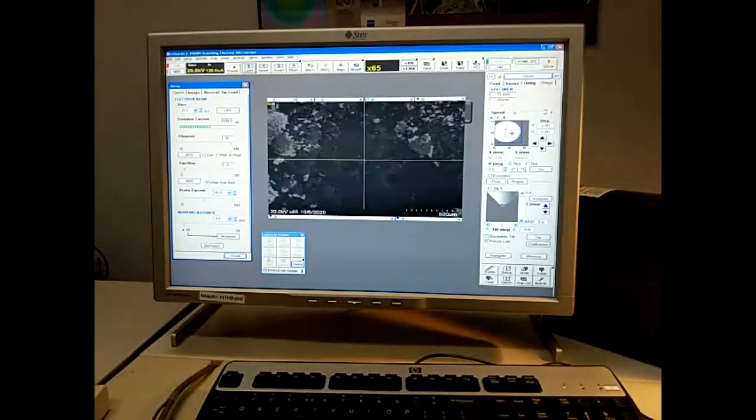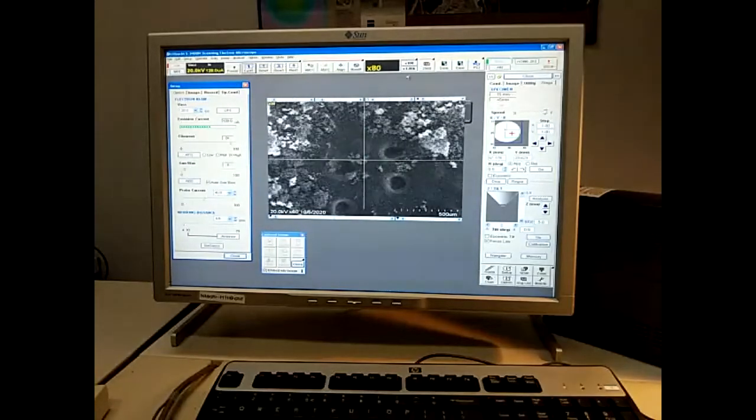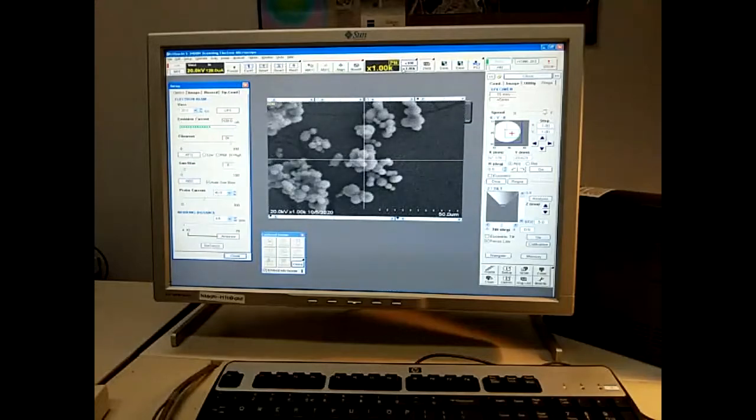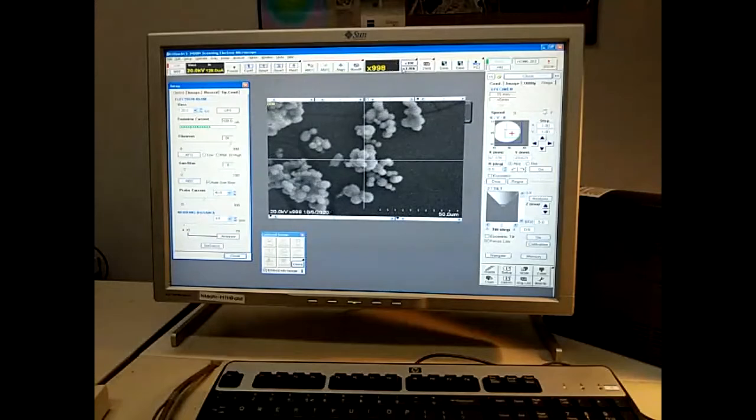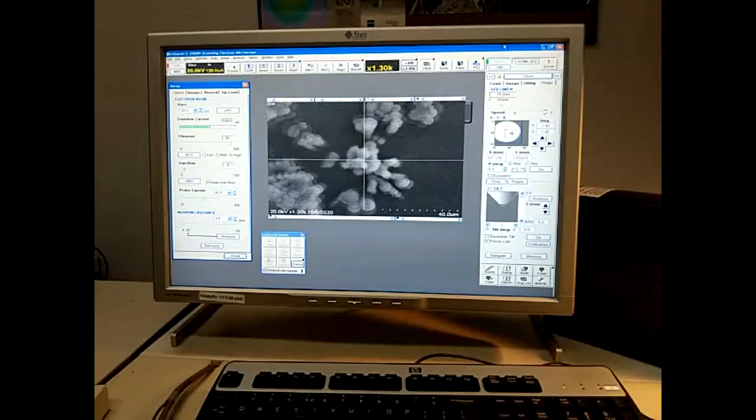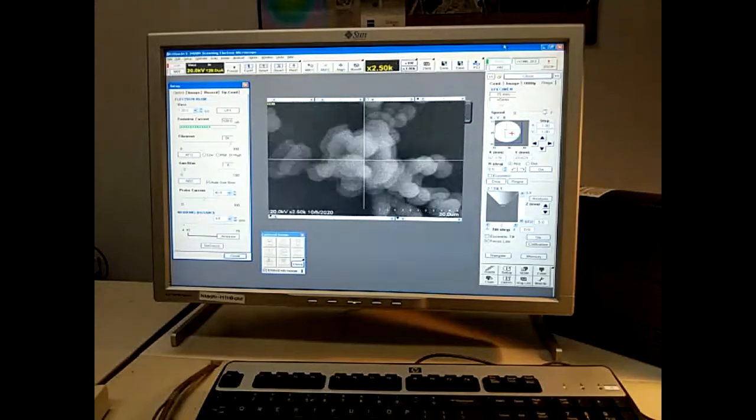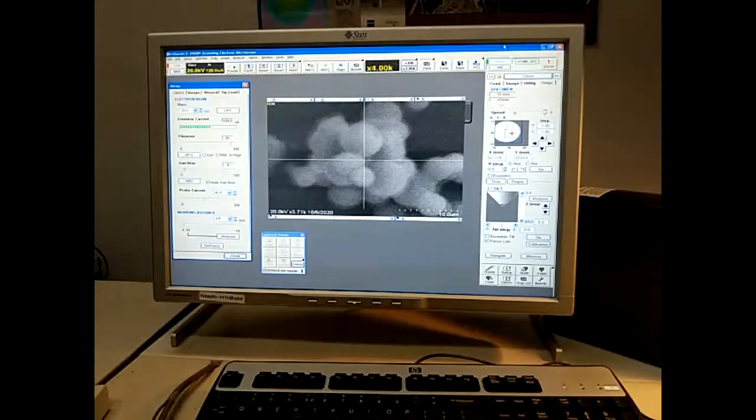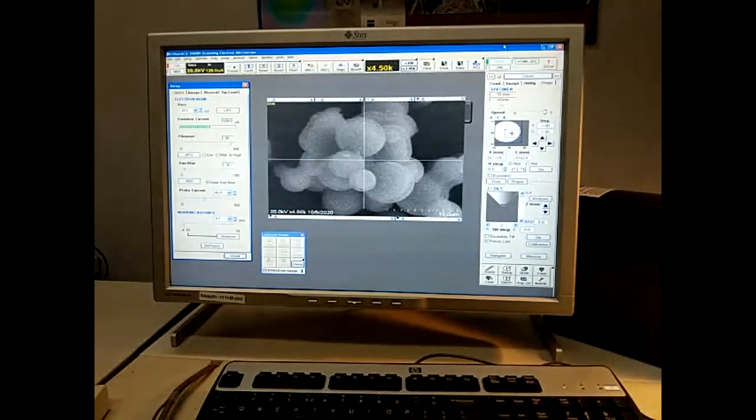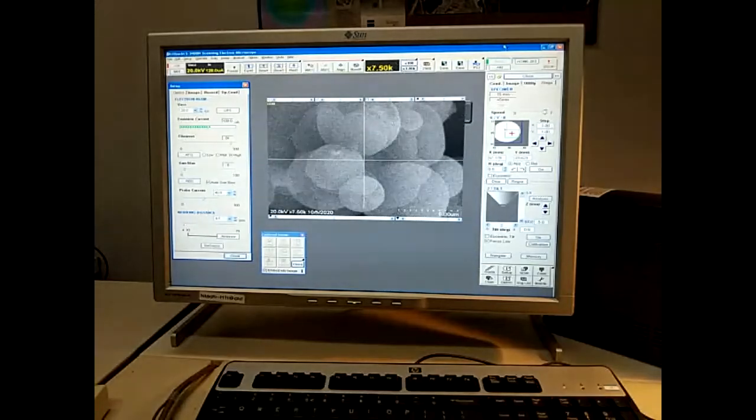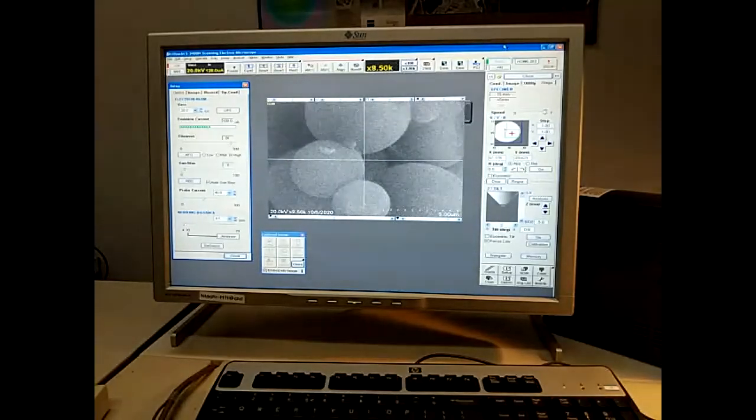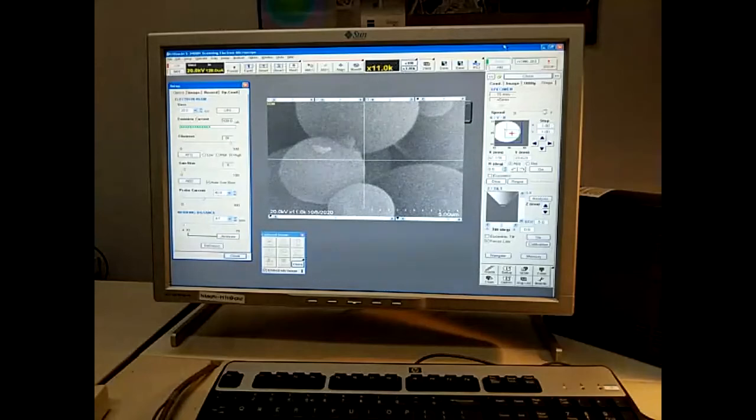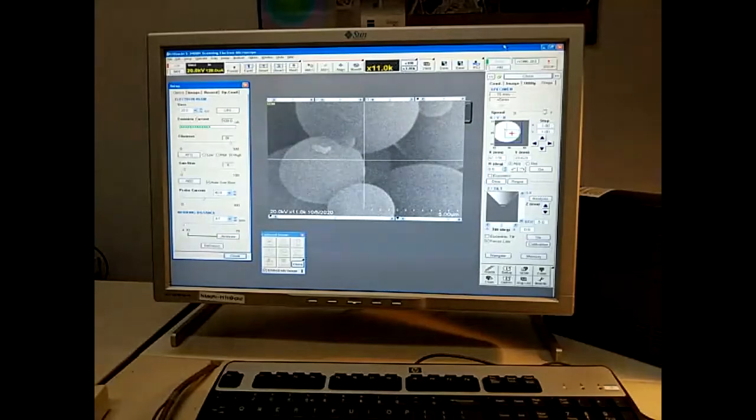Turning it up, we'll go to 100 times auto setting, 1000 times auto setting, doing a little focusing. Zooming in now more: 4,000, 5,000, 10,000. That's on fast mode, as I said.